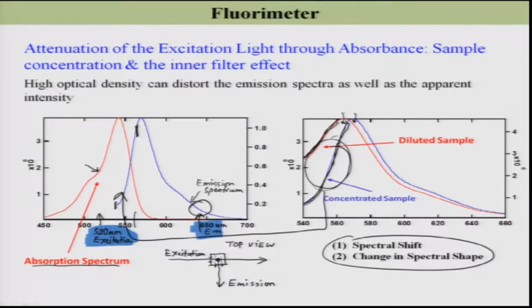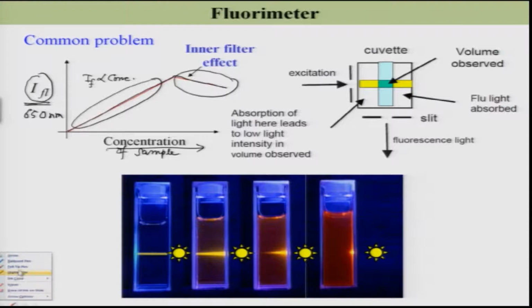So, here I am exciting and here I am monitoring. 520 nanometer excitation and 650 nanometer emission. Still, what I am going to see is an increase initially, but then a decrease, and that can be explained with this photograph.